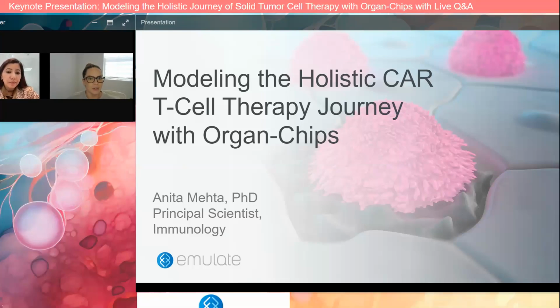All right, thank you. The next question that we have here says, what other immunology applications are possible with organ chips? What are the ranges of diseases that you can model?